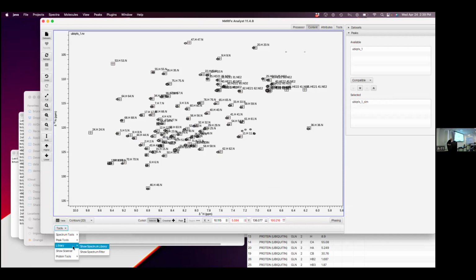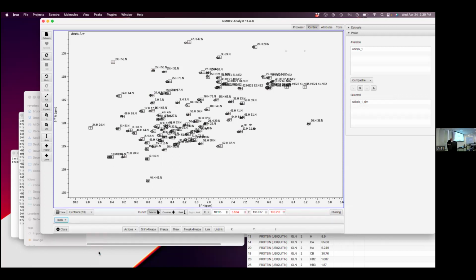Here's a tool for the RNA people, really, and we don't have time to show this in the RNA mode, although there's videos on our website. If I pull up this peak slider, I click on a peak, I can slide it into place and click tweak and freeze. It's tweaked that peak to find this exact position, and it's frozen in place. It's turned red, so I know that peak I've manually moved in place. But this is where we cross our fingers.